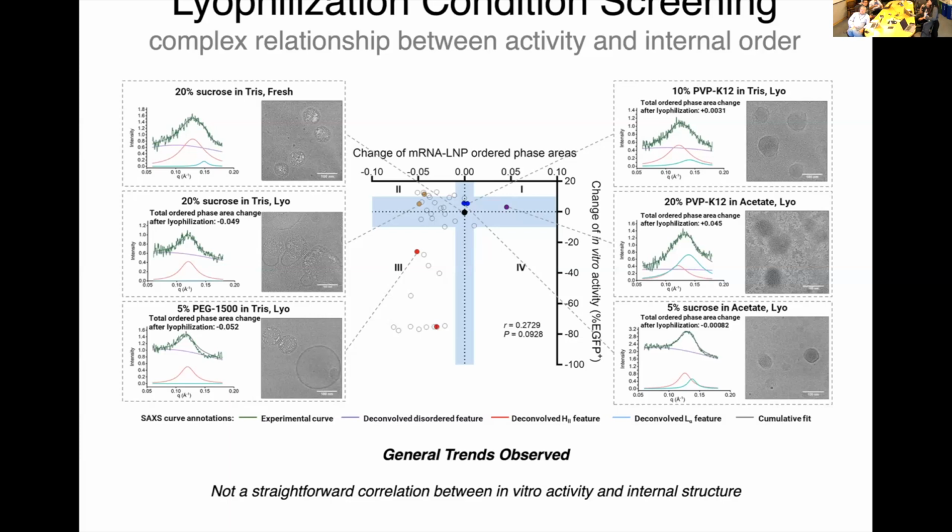Yeah. In a lot of the cases, even if they lose internal structure, and sometimes there's very little structure that I can still see retained after lyophilization, in some cases they saw absolutely no change of activity. So it was still really effective, even though internally the structure wasn't there anymore or as visible.